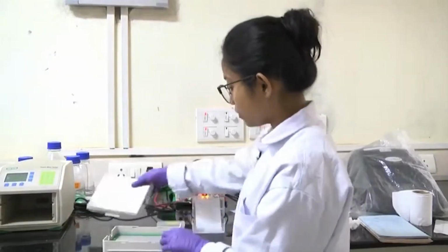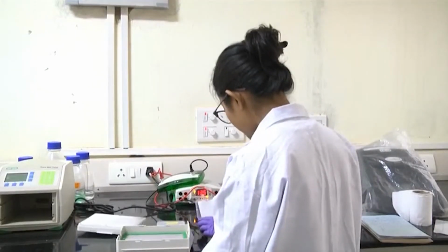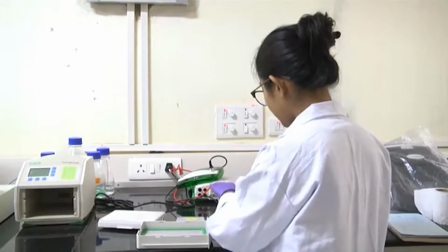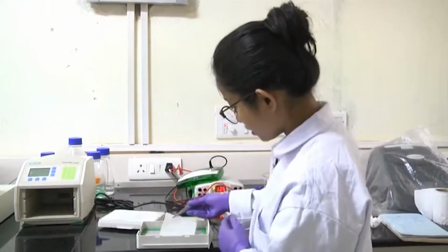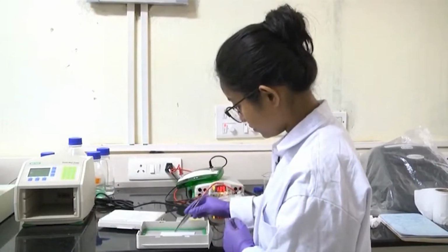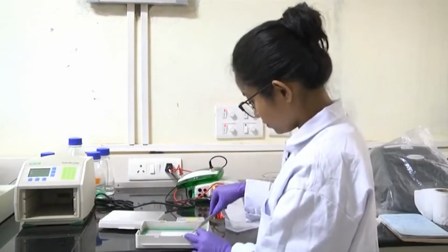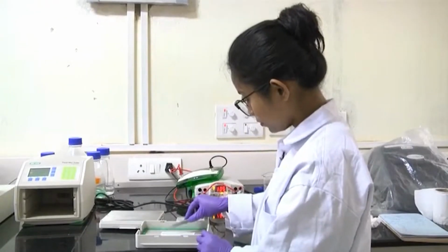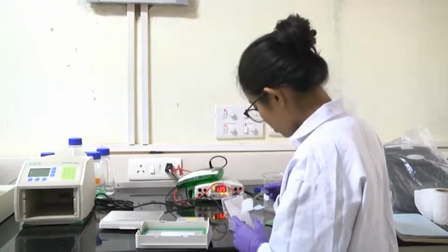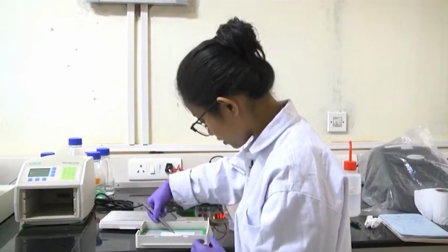This is the instrument which we have. At the bottom part we will take blotting papers. At the bottom we usually take 4 to 5 blotting papers. Place them here. This should be properly soaked. Then we will put the membrane. Do not touch the membrane with bare hands. We will put the membrane here.